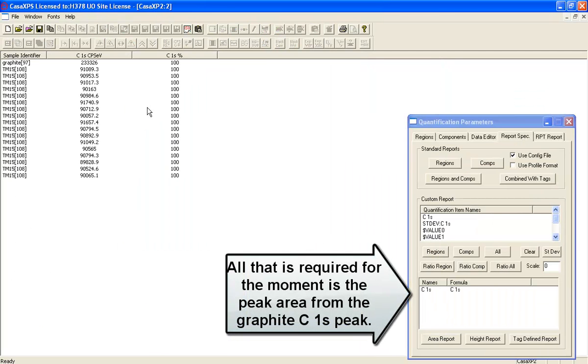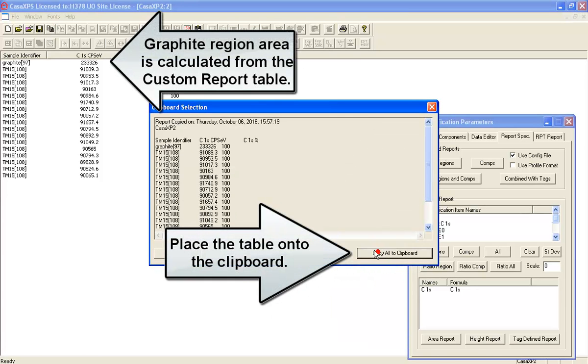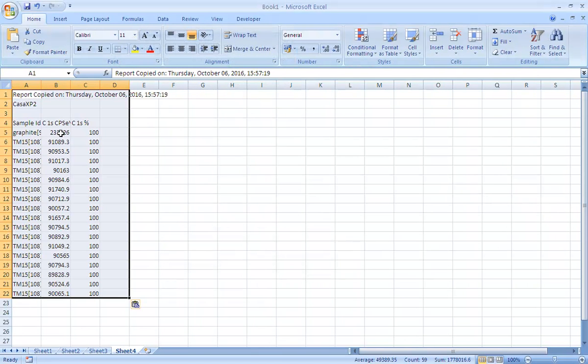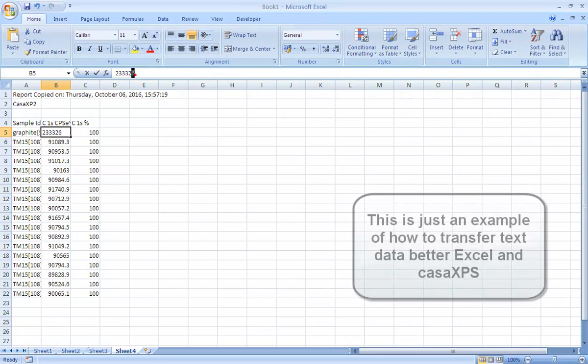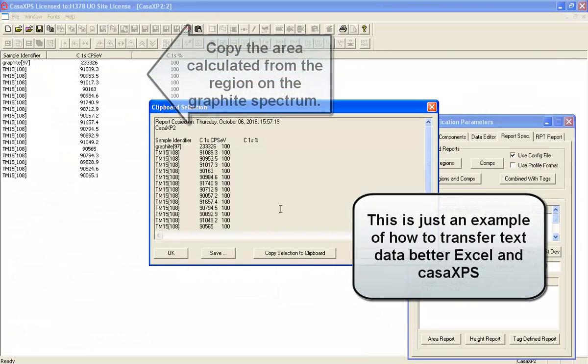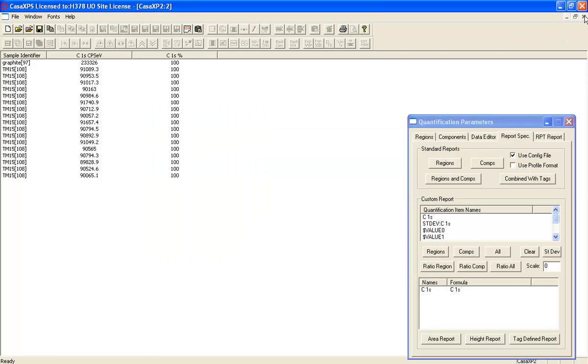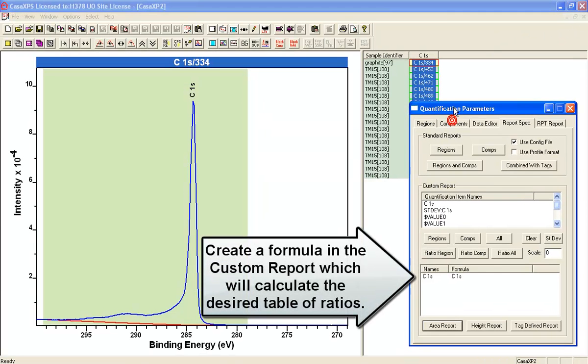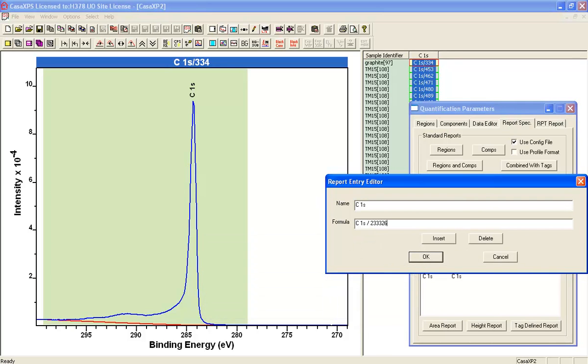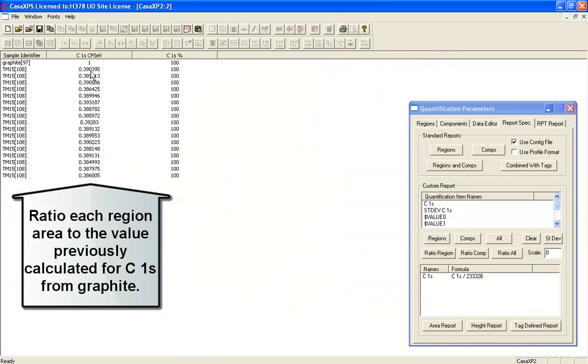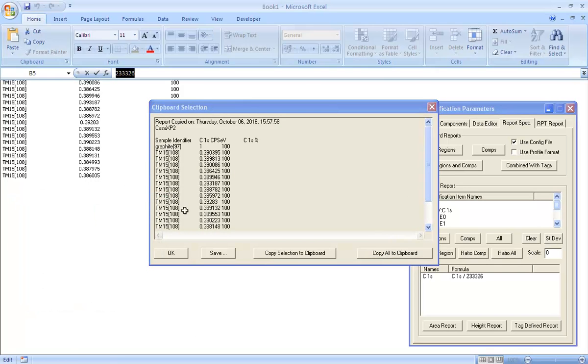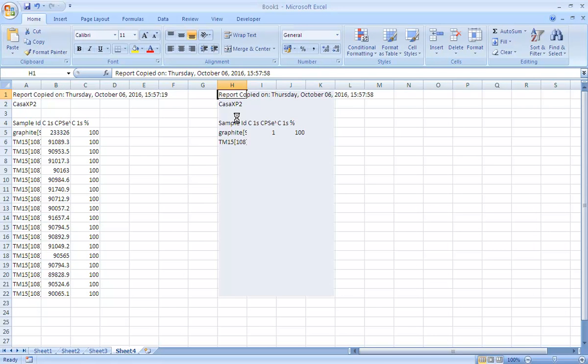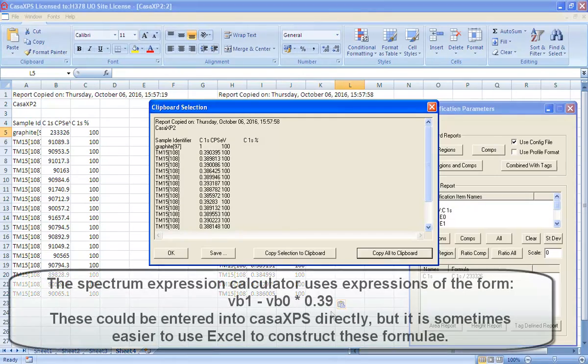Having calculated these areas, we can now work out a ratio for each one of these measurements that will tell us how much we need to remove from the valence band an amount of graphitic signal. Having calculated what the area is for the graphitic peak, we can now work out the ratio for all of these nanoparticles on the graphite. This gives us a table which we can now use to calculate appropriate formulae that can be used in the spectrum calculator in CASA XPS.